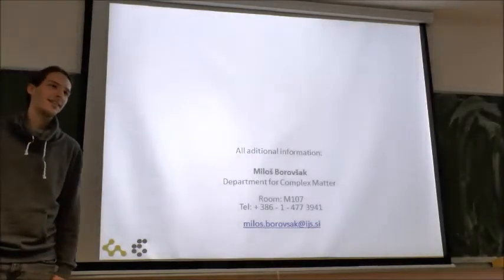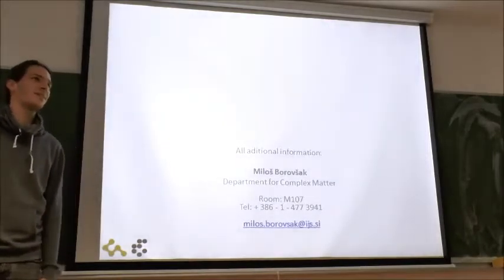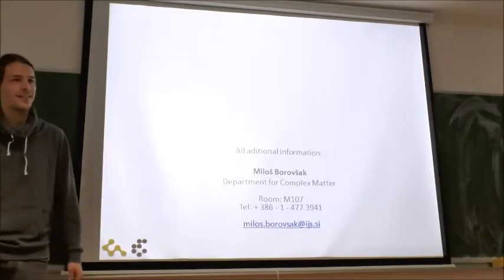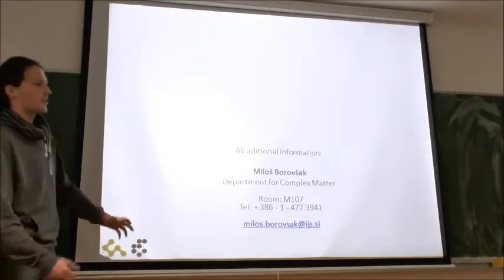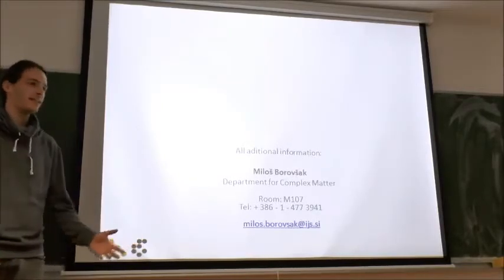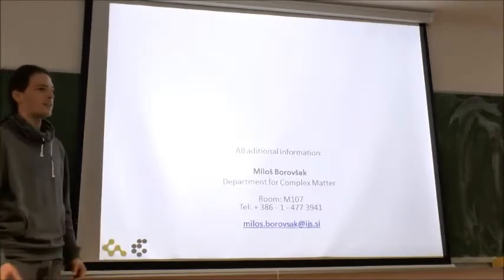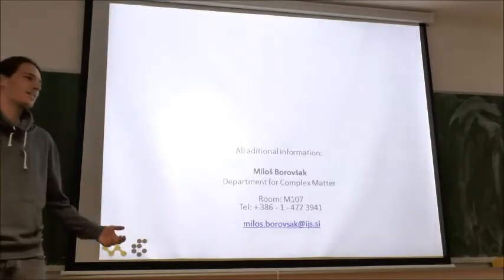Somebody else? What was the price of this machine? It was something around 600,000 euros. Yes, 600. Well, we have actually one additional AFM that is in vacuum, but we cannot use it in combination with the Raman. So actually there are three systems there.